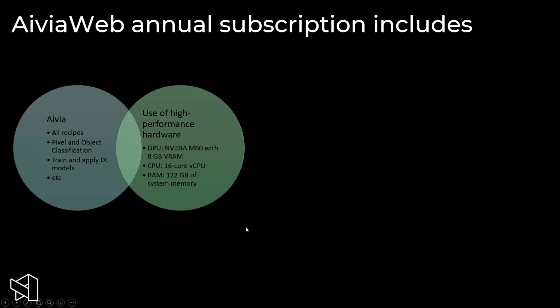So what's included? You get all of the recipes, the pixel and the object classification tools. You also get the train and apply platform, and basically anything else that Aivia includes. Now, for batch processing, even though it is included, it does require all the data to be available and accessible, so there may be some limitations for the use of batch processing with Aivia Web, which we can discuss in more detail once you explore this functionality.